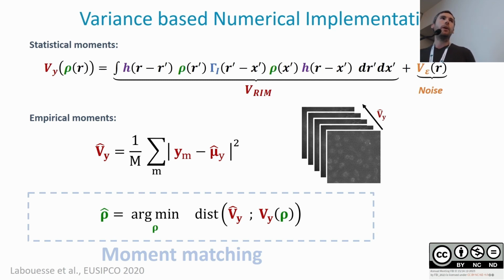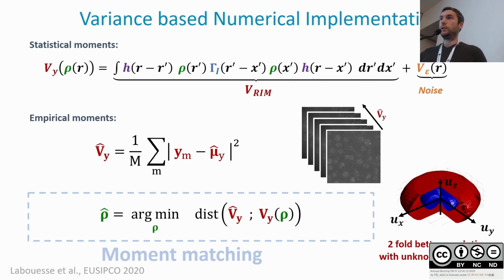We also have a mathematical proof that in ideal conditions, we can solve this equation without ambiguity, and this result tells us that we can double the resolution of the microscope, like in SIM, for instance. Same kind of resolution improvement, both in terms of lateral increase and also axial. So the optical sectioning will be increased a lot. And this is with unknown illuminations.